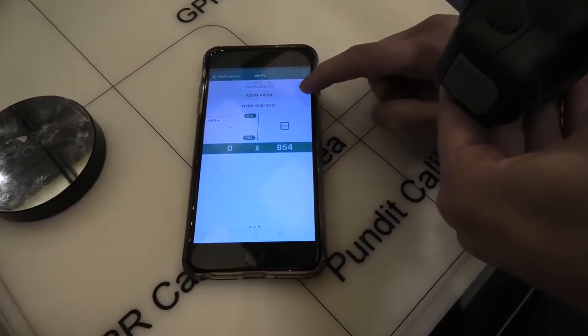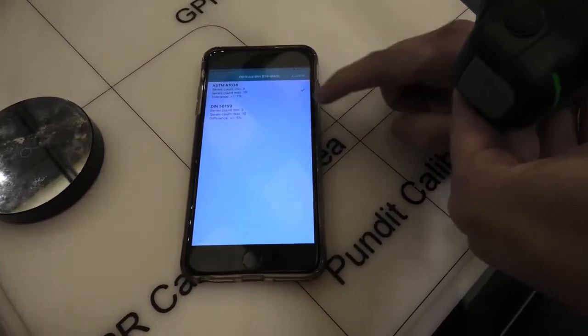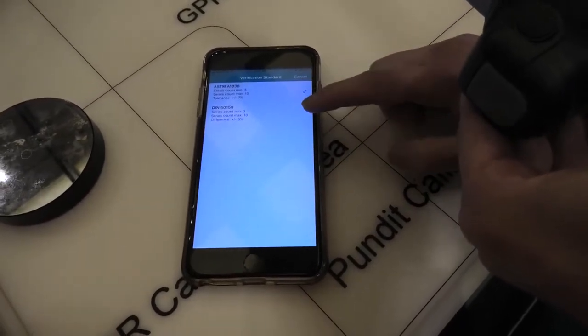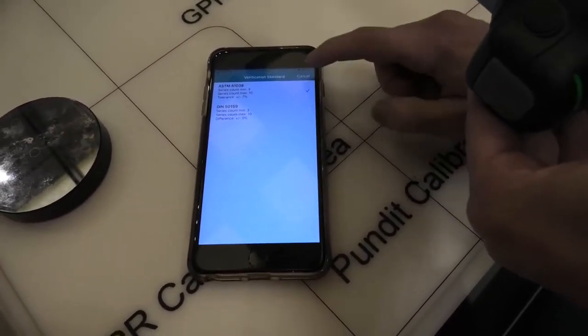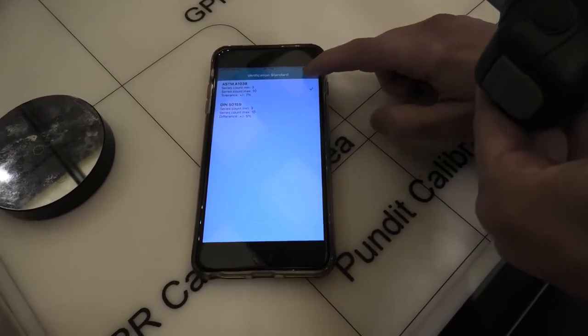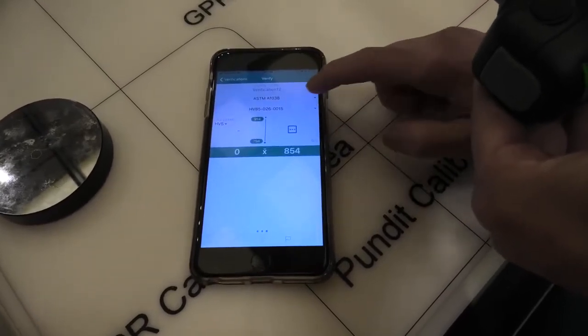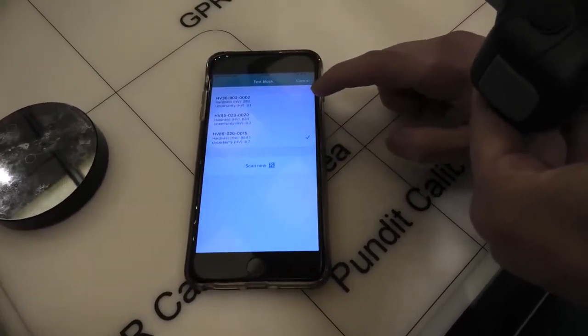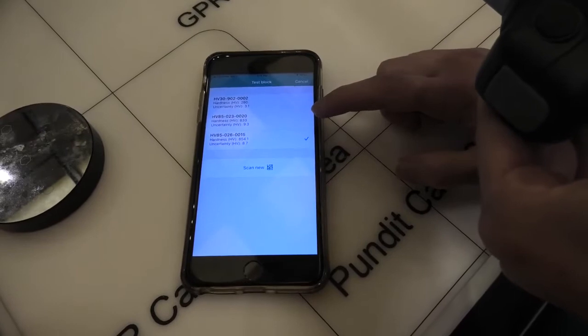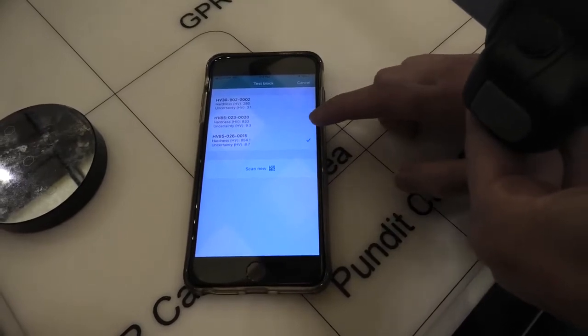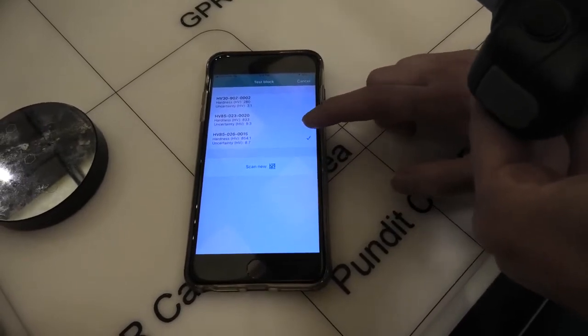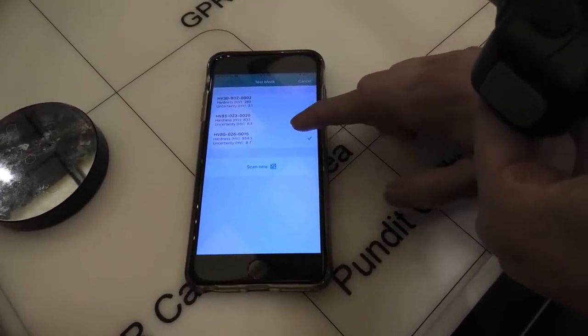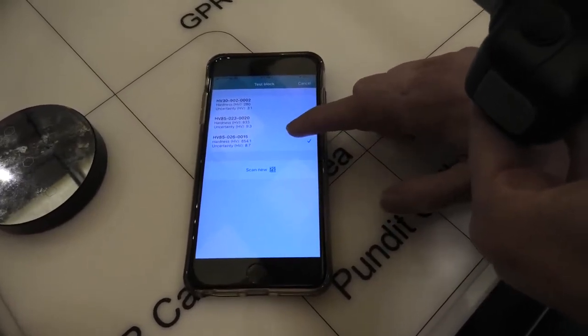Here we choose the standard that we want to use, either ASTM or DIN. And here we choose the calibration block that we're using. So we check the serial number matches the serial number on our calibration block.